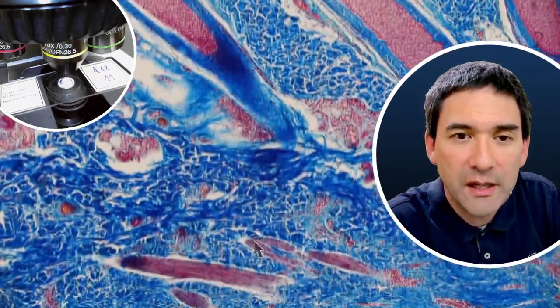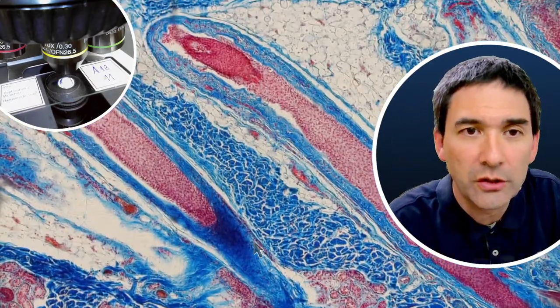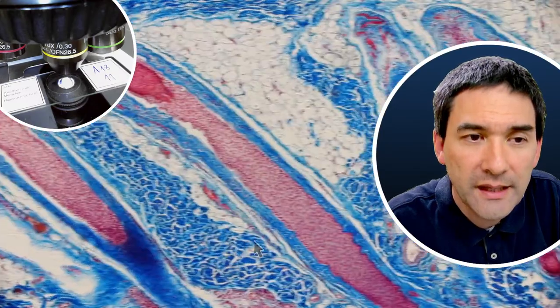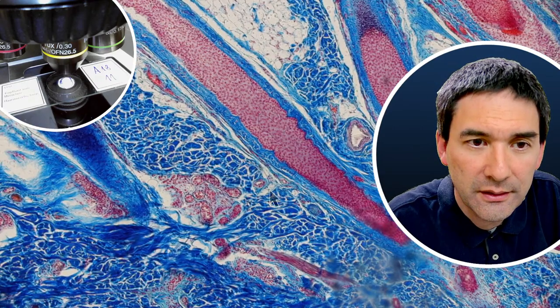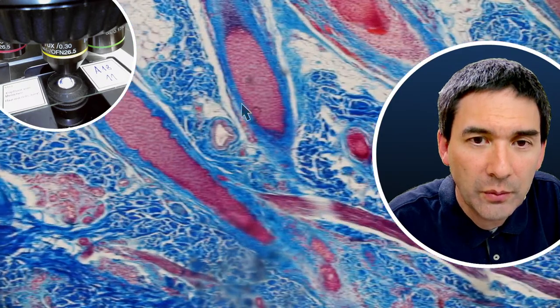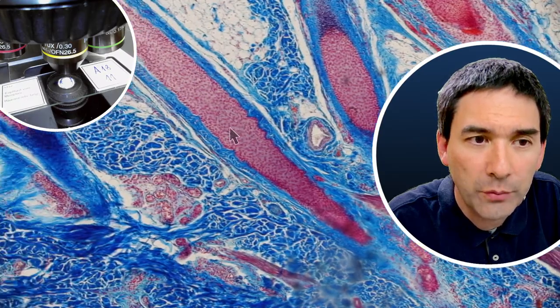Okay. So this is basically the cross section through the scalp of a person. And what we see here is those large red things. They seem to be the hair follicles. And those large red structures, what they do is there is hair essentially being formed here.